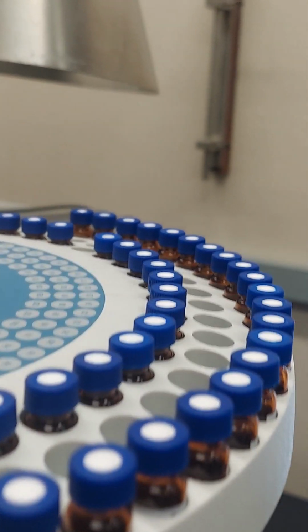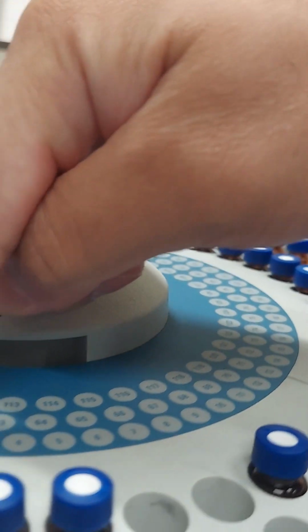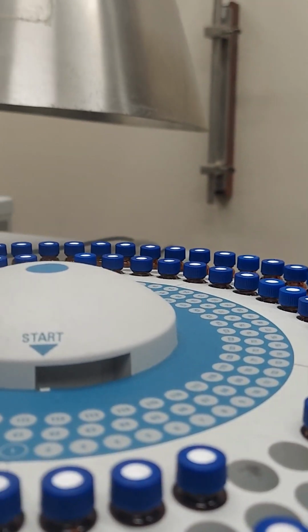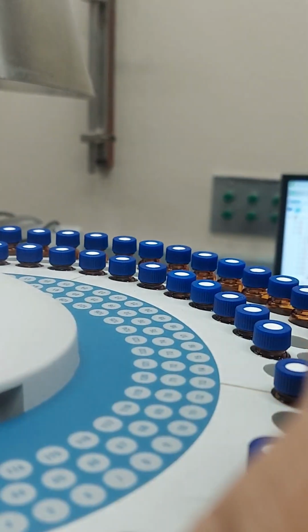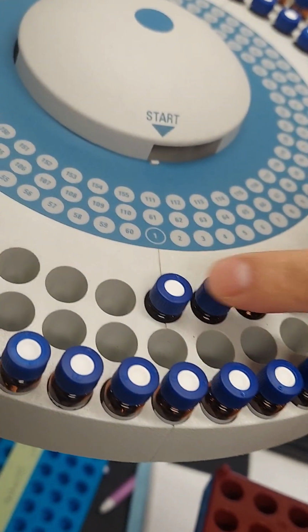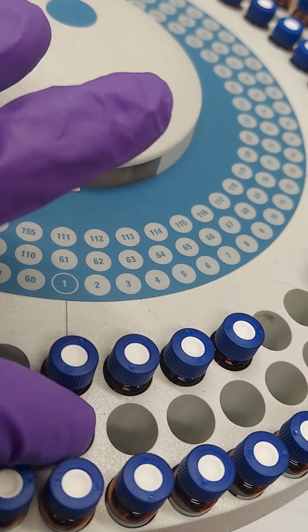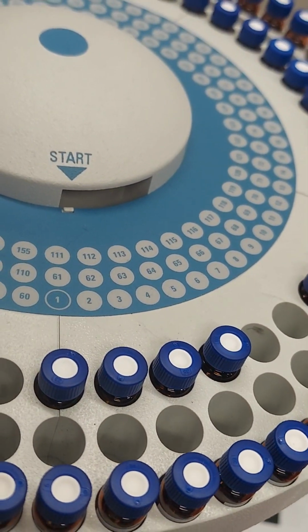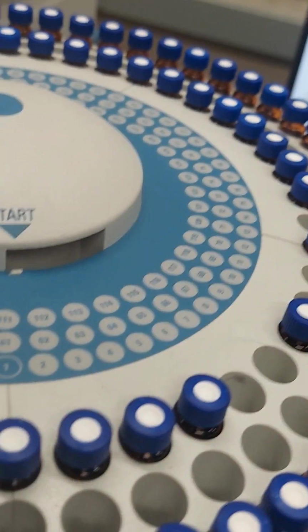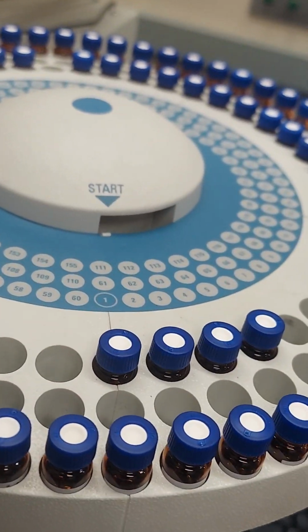So that's the numeration here. Oh, this. Yeah, it's a little hard to start. No, it starts at this one. So 1 is this row, 61 is this one, 111 is this one. Okay. It follows the layout. And you only need to put according to this number. Yep. So it's easy to make mistakes here.